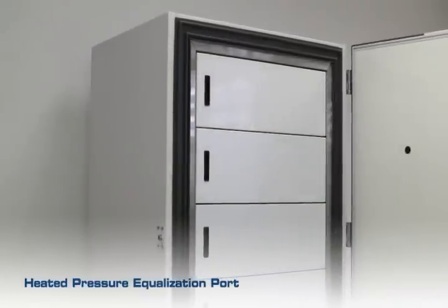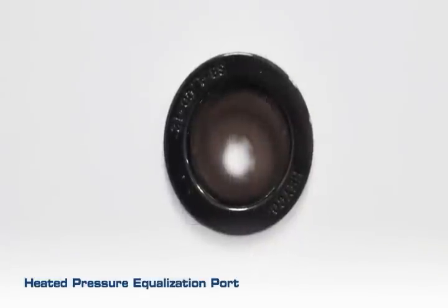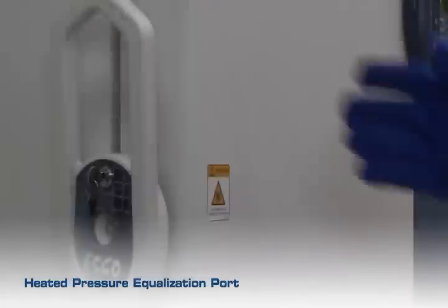ESCO's Pressure Equalization Port prevents vacuum formation inside the chamber, allowing the door to be opened quickly.